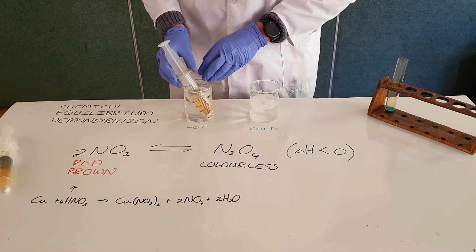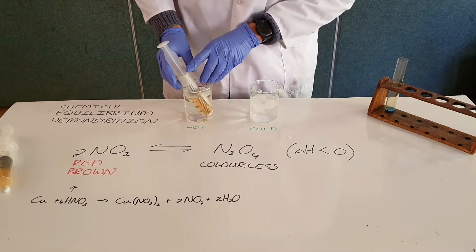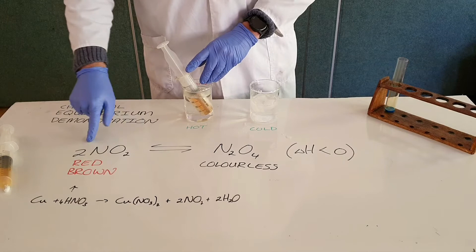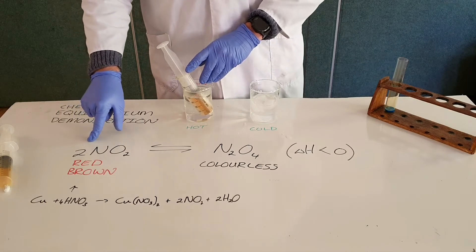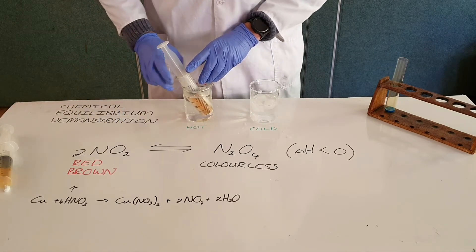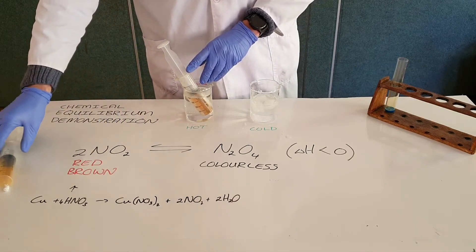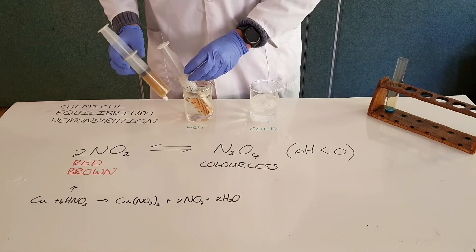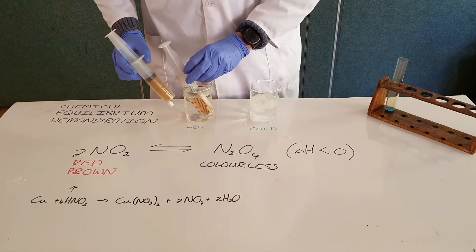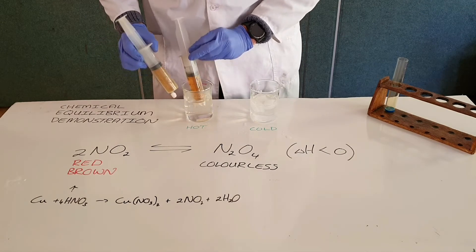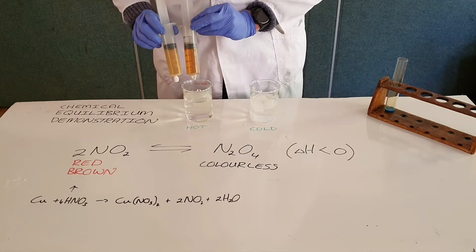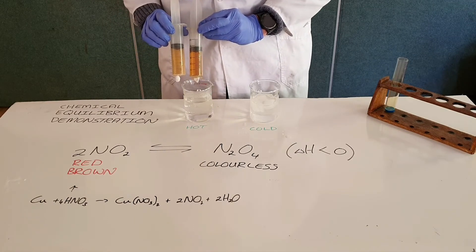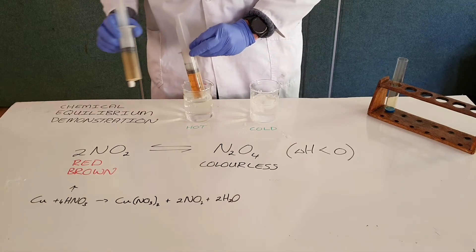By adding it into the hot water bath, we can see that the color change favors the reverse reaction, which makes it a darker red or brown color. Comparing the two, we can see that the one that has been in the hot water bath is slightly darker than the other.